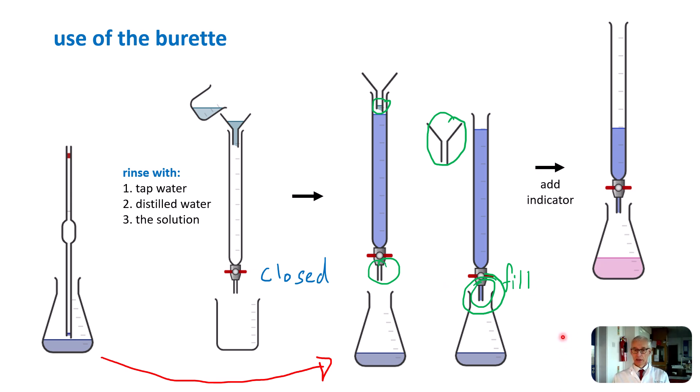Having noted the initial volume, we add some indicator and generally we'll see that there's a color change. At the color change point we stop the titration and we take the final volume. The volume delivered by the burette is the difference between the initial and the final and that is called the titer.